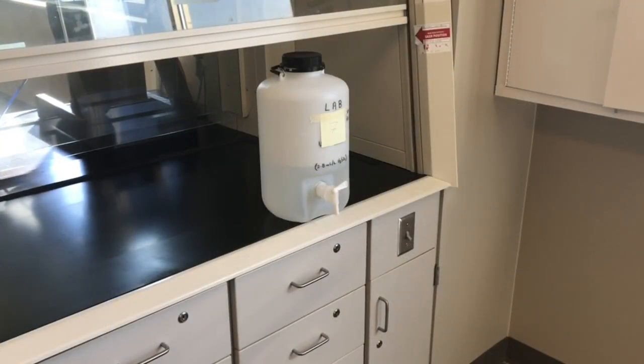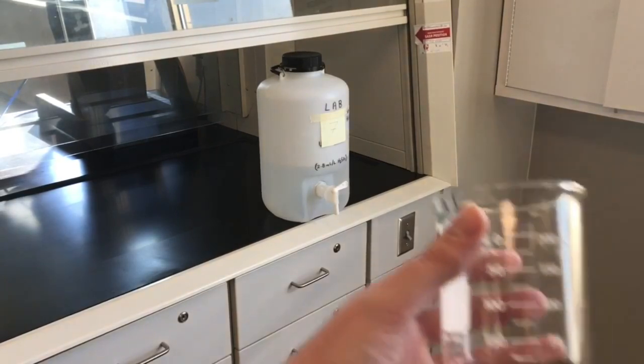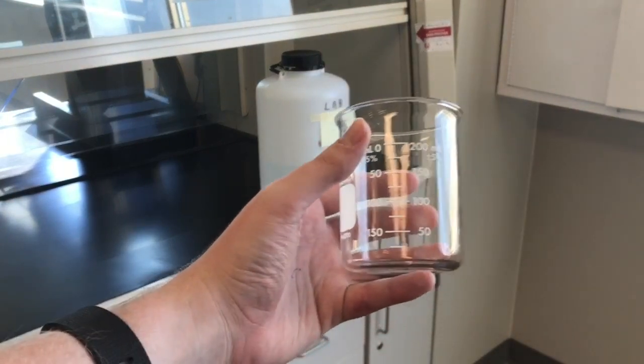All right, so once I've got my coffee filter set up, we can grab our sulfuric acid solution, which should be in the back by the fume hood over here. So we're going to want to grab 100 milliliters of sulfuric acid solution in our other 250 milliliter beaker.